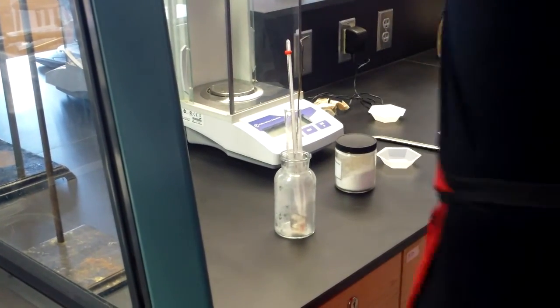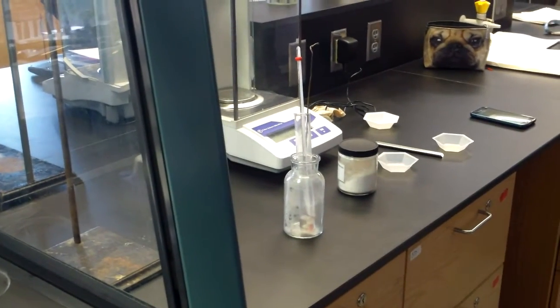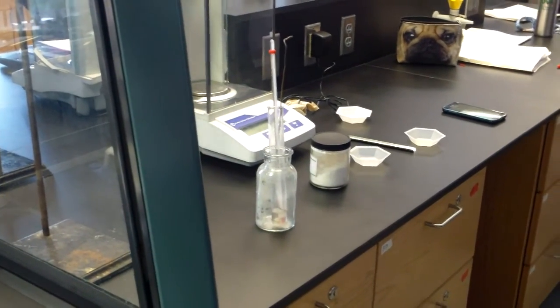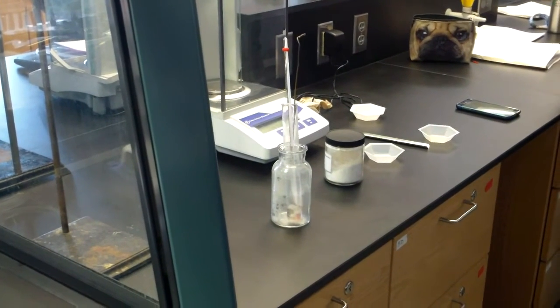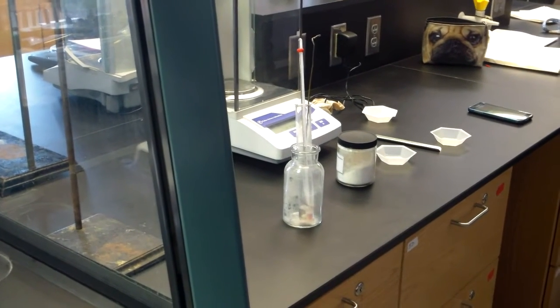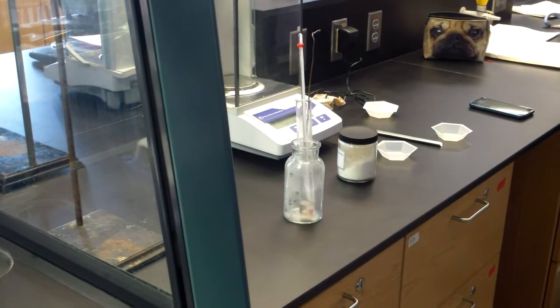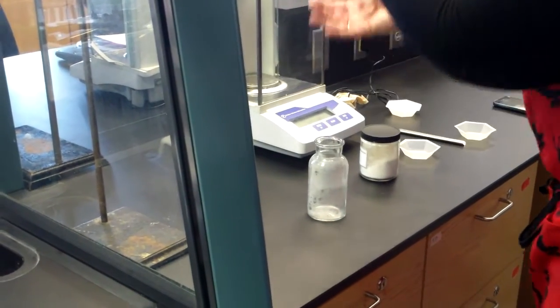Now, there's a lot of space to write data on your data sheet. You do not need to fill all of that out. You need enough points such that you can get the cooling of the liquid and the freezing of the solid, which means you only need 5 or 6 points here at the end. So even though there's space for 30, you don't need it. We good? At that point, you have found the freezing point of the naphthalene.